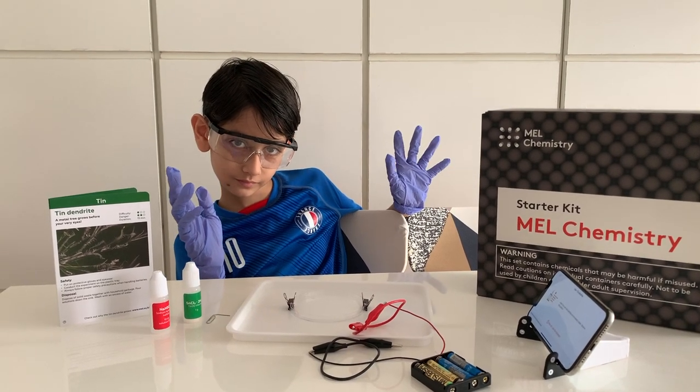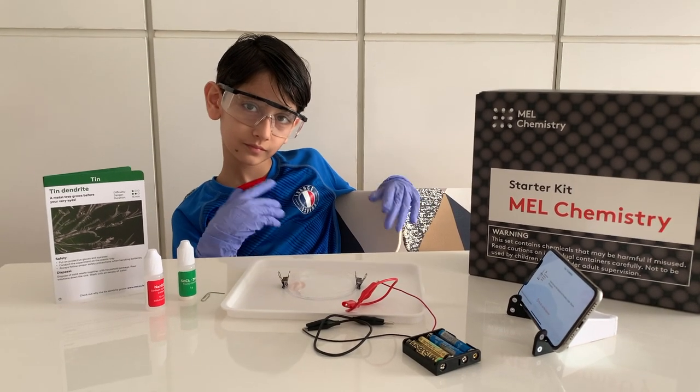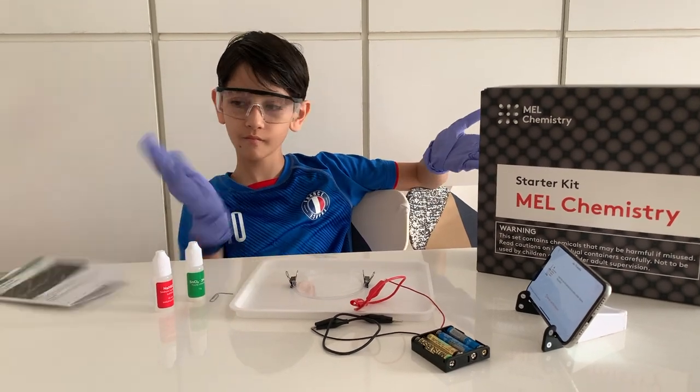Hello, hello. Here we are with our second MEL Chemistry experiment.